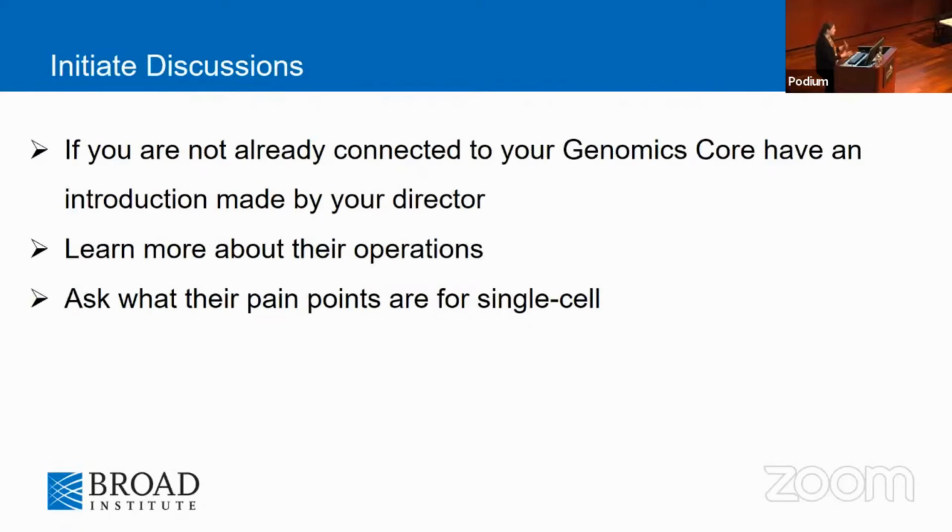And so the way that I got started is basically, I just talked to my genomics core and said, hey, would you like to collaborate on this? Because I heard through the grapevine that they were looking for space at the main buildings because their building is a few blocks away to have a cell lounge. And I was like, wait a minute, I'm the cell lounge. That's what I should be called, right? And so I reached out to them and said, hey, I heard you're looking for space. Do you want a bench in my lab to do this? People can come and drop off samples with you. And then people who don't want to do this as a service, I can train them if they want to be trained. And so that's kind of how it started.